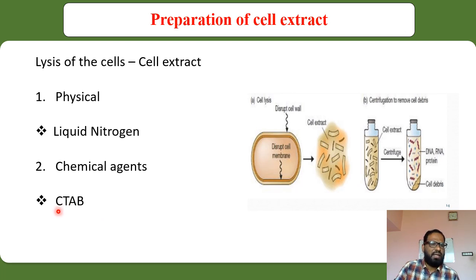Most of the time this particular technique is generally not preferred for the extraction of DNA from animals or bacteria. It is also used for the extraction of DNA from the plant cell. Then what are the techniques used for the bacteria? We use the enzyme called lysozyme. And you might know that lysozymes are very common in tears. Whenever you take your tears, they are very rich in lysozyme. Saliva is also very rich in lysozyme.